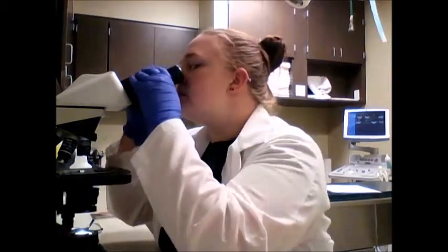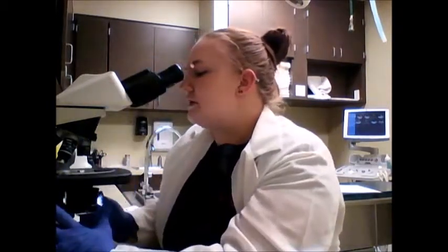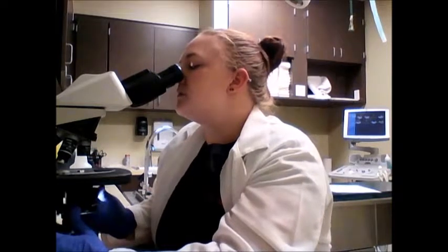Okay, so now we are going to look at Wendy's vaginal smear. She is going to be spayed sometime today or tomorrow, so hopefully we can figure out whether or not she is in proestrus, estrus, diestrus, or anestrus based on her smear. So let's go ahead and look on the 4X. I'm going to turn down the light some. There we go.